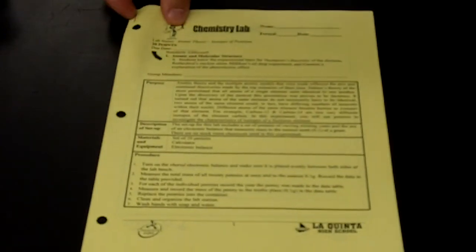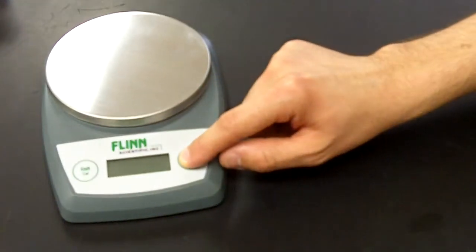The procedure has us first turn on the electronic balance. I'll slide the electronic balance into the view of the camera. The power button, pressing that. Balance warms up. Turn on the shared electronic balance and make sure it is placed evenly between both sides of the lab bench.